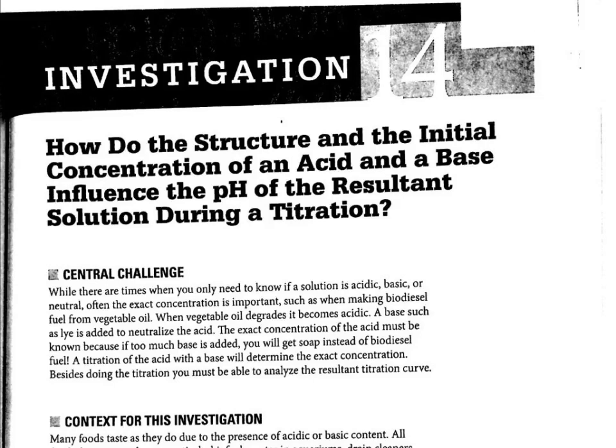Okay, let's go ahead and talk about how to write up the post-lab for this acid-base titration lab. This one's kind of strange. So I'm going to try and navigate you through the write-up on this one as best as I can. So basically, we've already talked about how to write up the pre-lab.